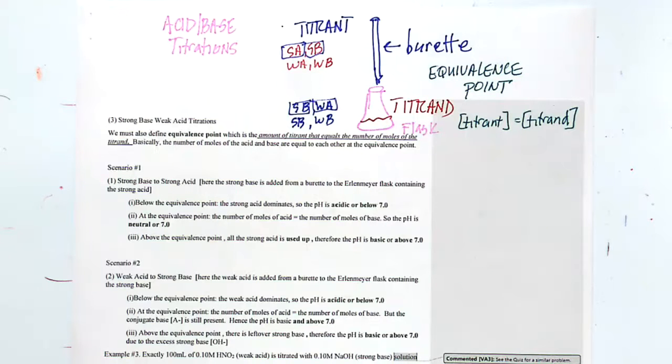This is also really kind of a knack. A lot of students overshoot. This is a problem, and I'm pretty sure I will also overshoot my titrations. When you add too much, it's going to be too pink. You don't want too much color. You want just enough so that they are equal to one another.